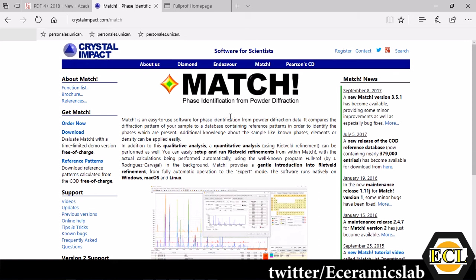Remember this is a beginner level tutorial that means the Rietveld Refinement that you are going to do is going to be fully automatic. You're not going to have full control over various parameters which can be found out using Rietveld Refinement. This is going to be automatic and this can be quickly done to get your lattice parameters and other parameters which is required for your sample.